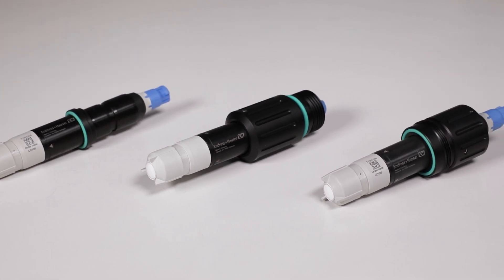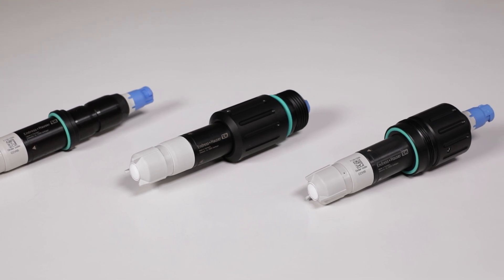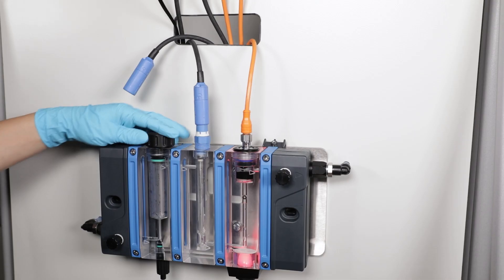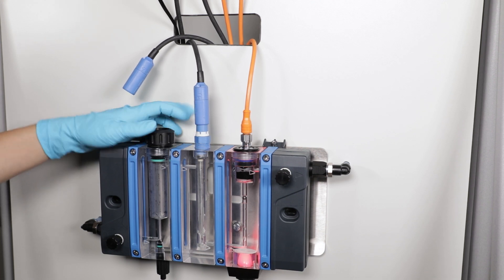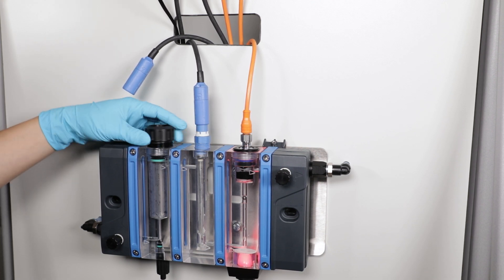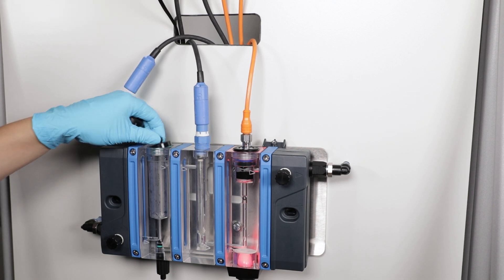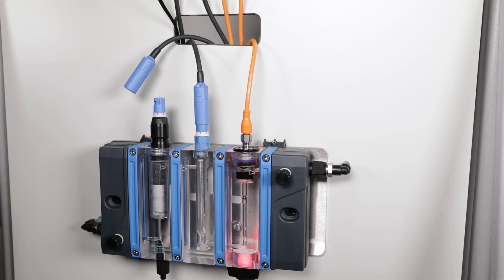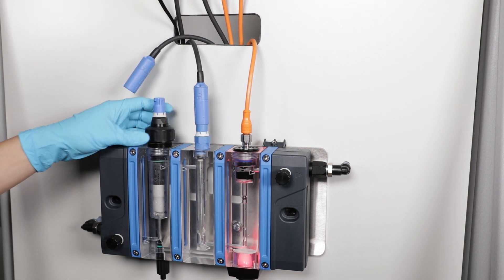First let's take a look at the installation into the Flowfit CYA27. Remove the blind plug from the CYA27 assembly and insert the sensor. Screw the coupling nut onto the assembly.